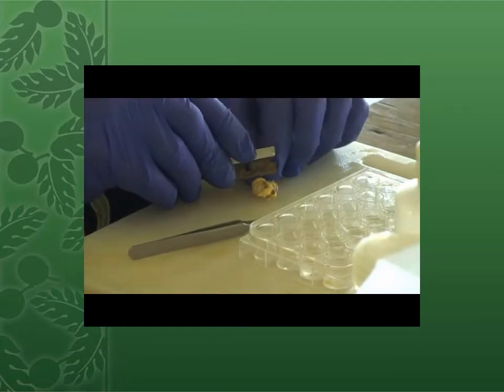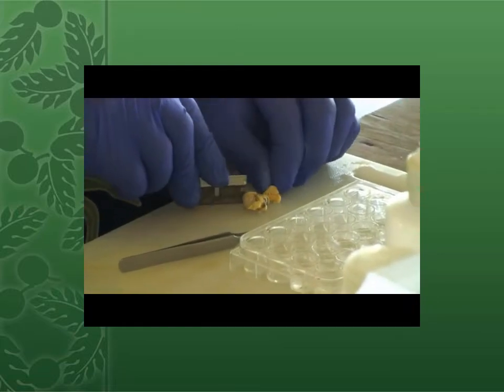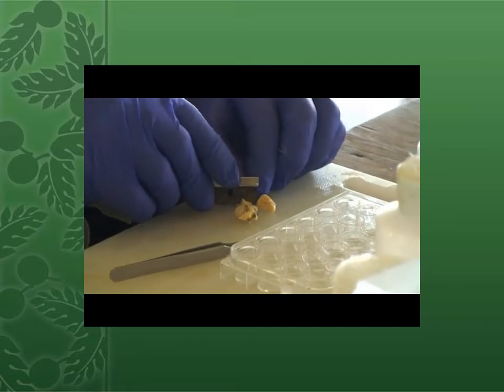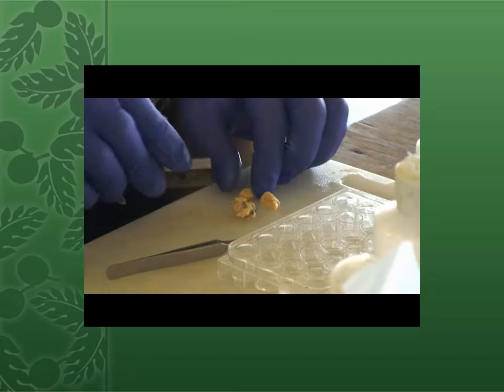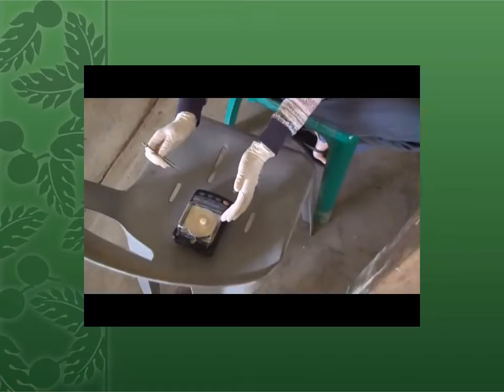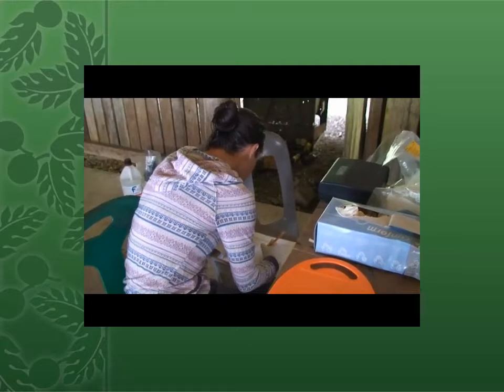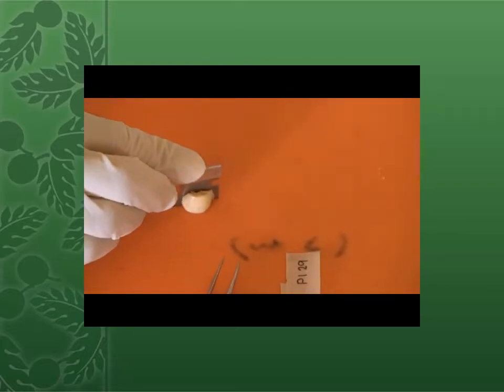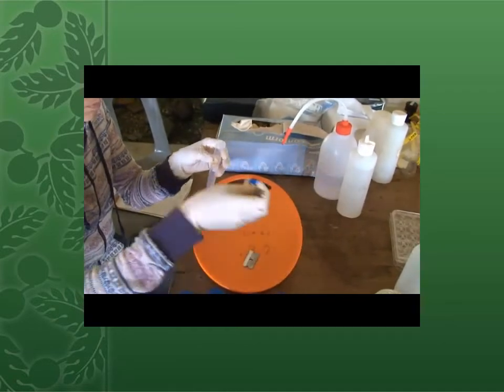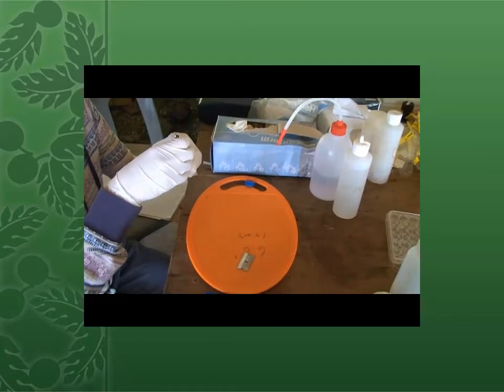This next step is only for females that look like they're ready to spawn. Take an approximately 1 centimeter cross section from one lobe of the ovary, weigh that sample, and record its weight. Take the sample and cut it in half. Add it to a container along with the larger portion of that two-part specimen tag.